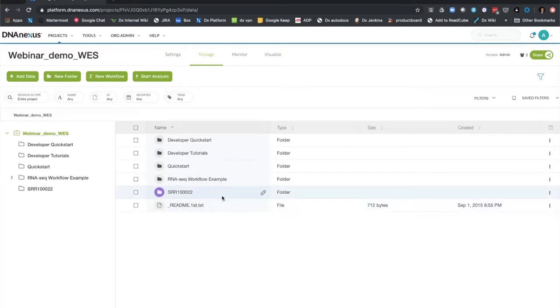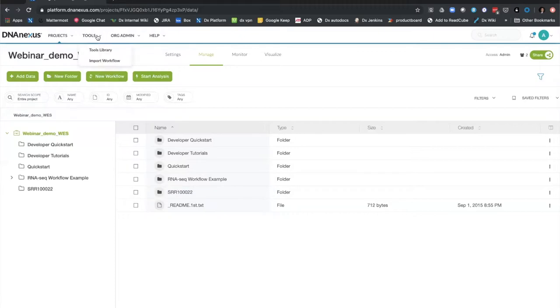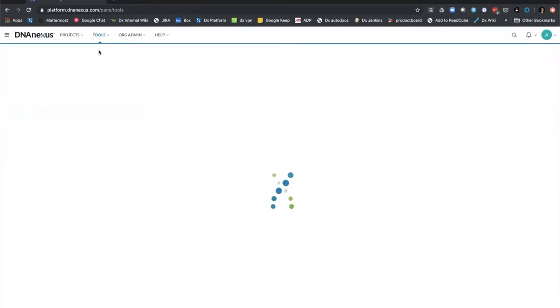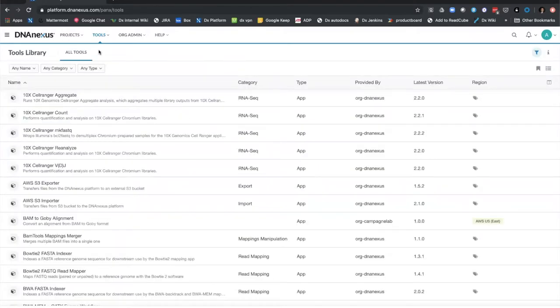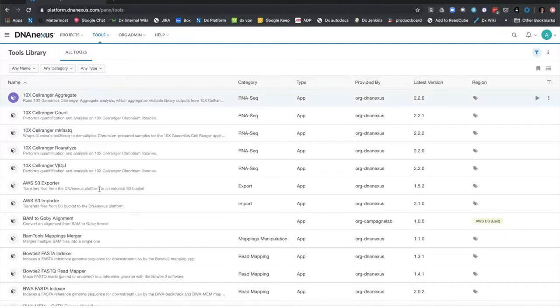I've gotten some data, explored the metadata, and shared it with a user. To run an analysis, I can go to the tools tab on the top left-hand side and click on the tools library, which pulls up a list of the most commonly available public tools on DNA Nexus. This is not a complete list but an example to show platform capabilities. If you have your own scripts written in R, Python, or any other language, you can develop an app on DNA Nexus using the SDK and share it with users.